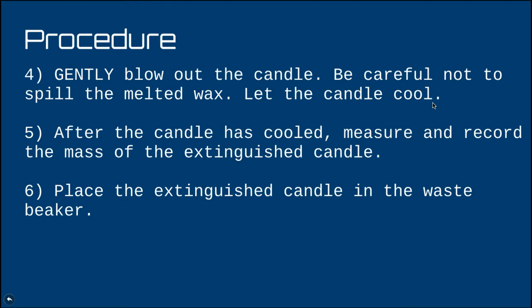And then to finish it off, make sure that you put the candle in my waste container. It'll be a beaker at the front of the classroom. And this is just so I can reuse them later on.